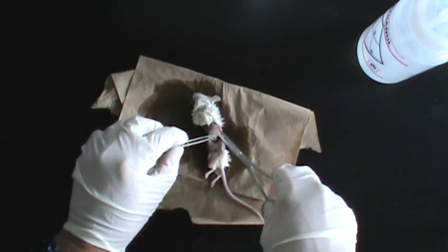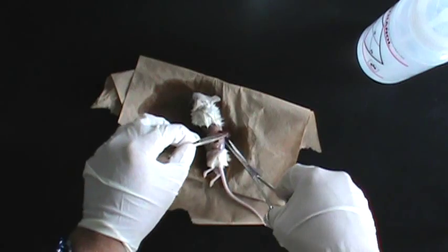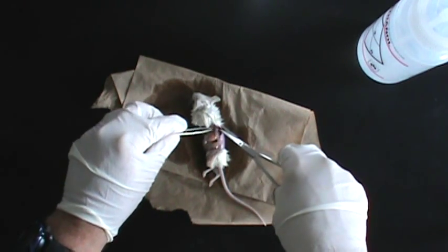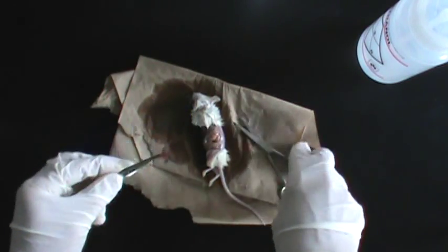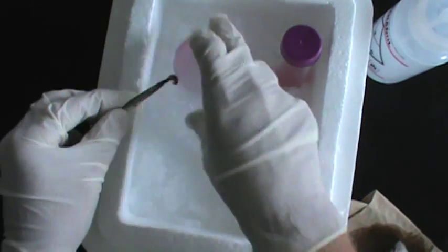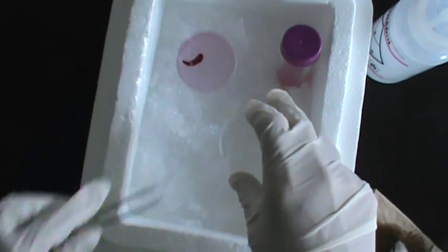Make a small snip in the muscle wall and remove the spleen, trimming off as much of the connective tissue as possible. Then we're done with the mouse at this point in time. Put the spleen into the dish of cold culture medium.